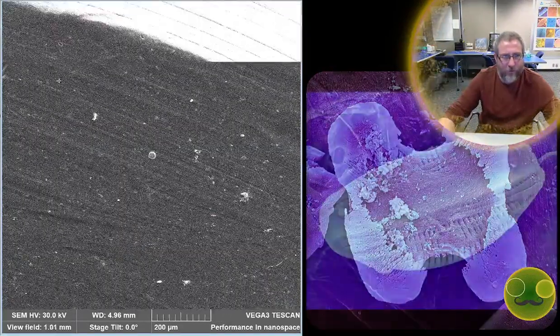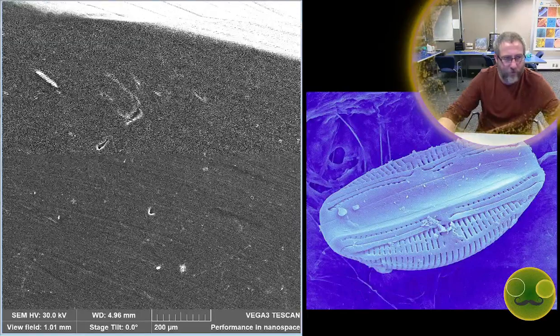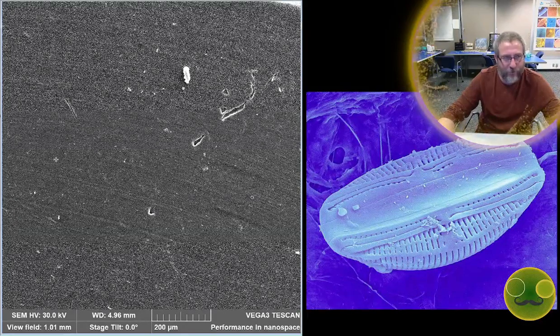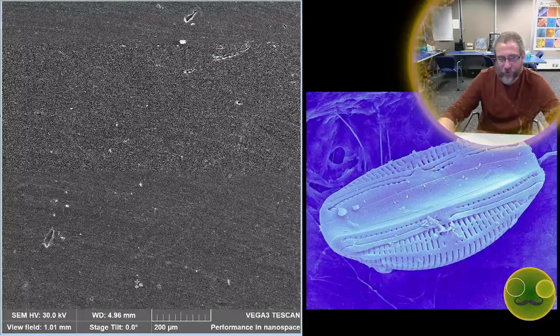All right, let's look around for a little bit more on this stub. It might be helpful if I could find a girdle view, like a full girdle view of the specimen. I think that's the only view that's really missing.